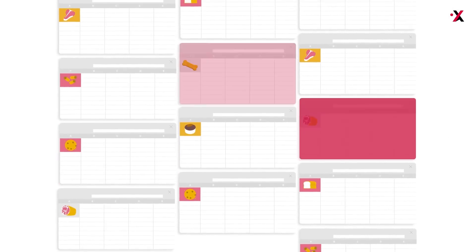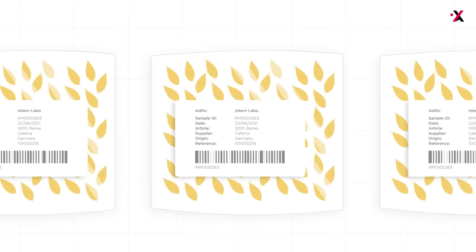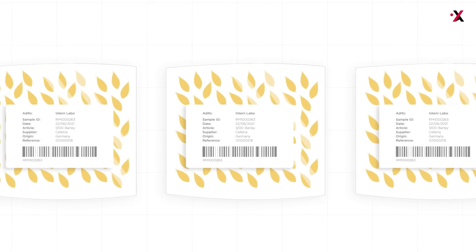It registers relevant sample information, assigns tests to be done, and generates the required labels.